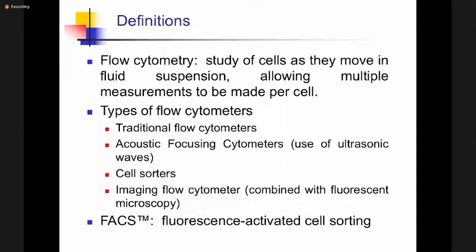You can make a touch preparation on a slide, touching that fresh tissue which has come from the theater onto a slide to collect the cells you are interested in. Then you suspend that cell in a fluid buffer, which enables you to have a single cell suspension. If you pass that cell through the laser, it will get some excitation, and that excitation produces a signal with which you can analyze the properties of that cell, whether it is tumorous or not tumorous.